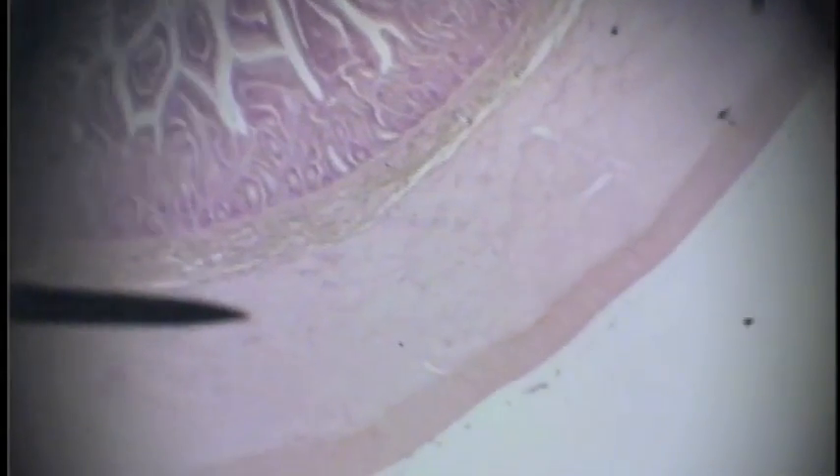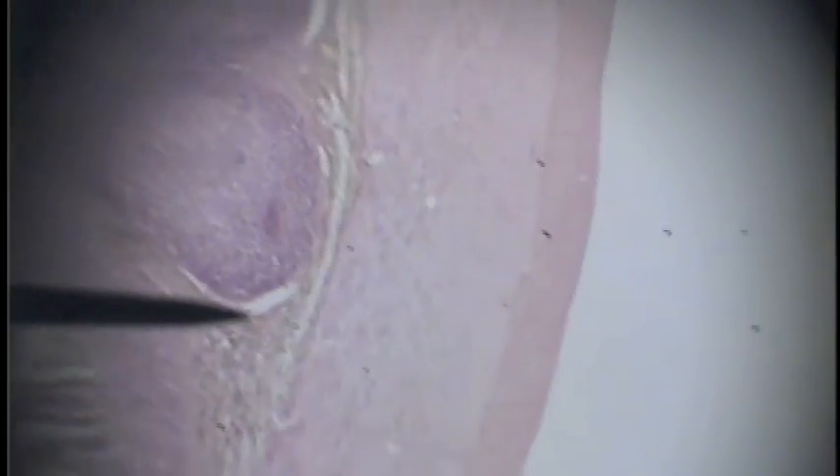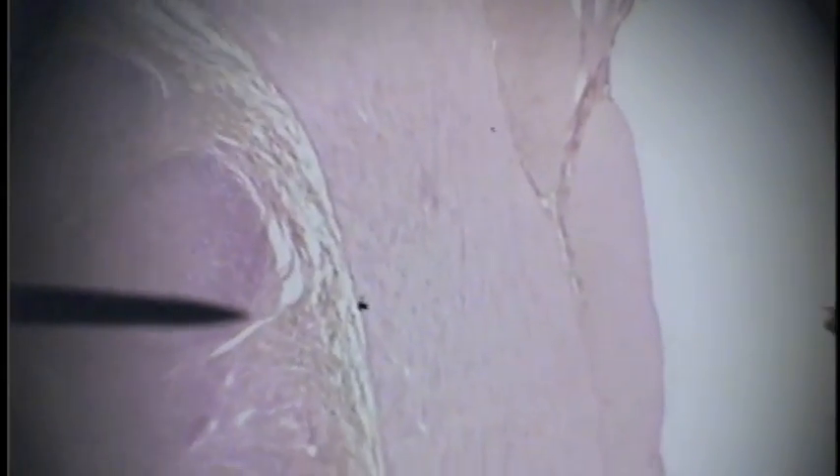Now we are looking at the submucosa of the ileum, following that brownish line of submucosa around. Within the submucosa we find large lymphoid nodules called Peyer's patches. That's how you tell it's the ileum — it contains Peyer's patches in the submucosa.